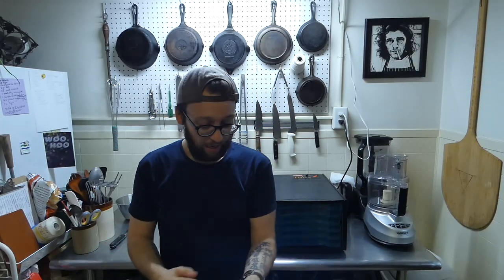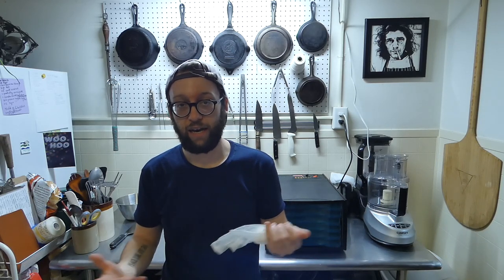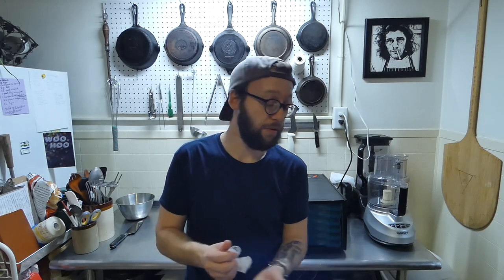All right, so I will be back with you guys in about 12 hours to check on these. At which point, they'll either be completely dry and we'll weigh them out, and that way we can calculate how much yield we got from the original amount, which will be kind of cool to see. Or we'll put them in to go a little bit longer. If they need more time, it'll probably be about 5 to 6 more hours.